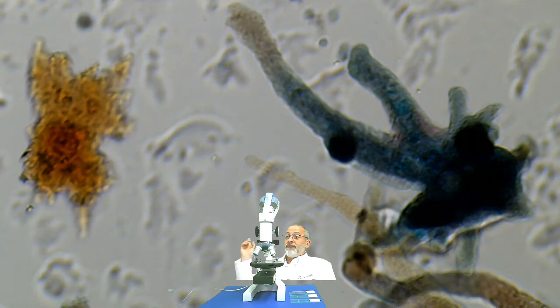So these false feet that you see protruding out are dynamic structures that ooze and pull, ooze and pull. And do you remember what they're called? Pseudopods. So take a moment, if you need any more time, to pause this video and illustrate with 40 times magnification.